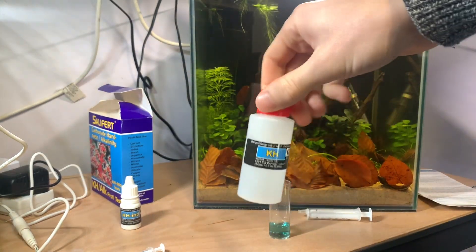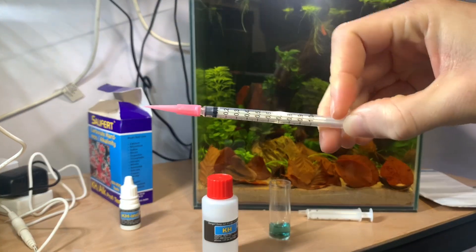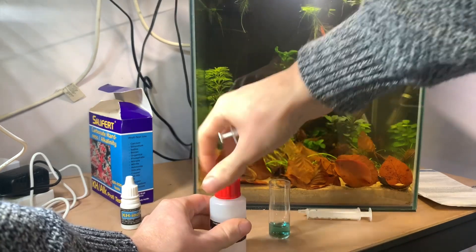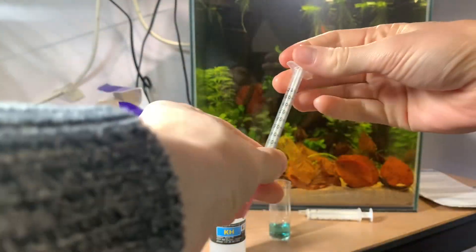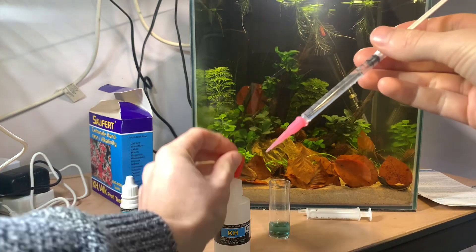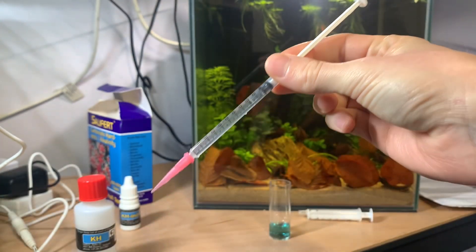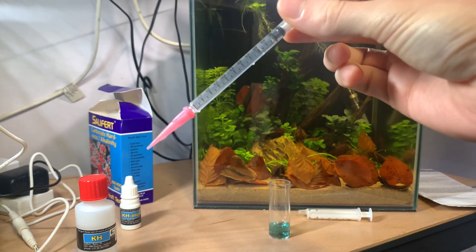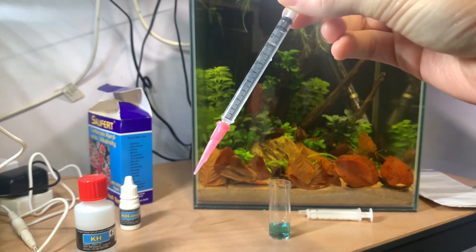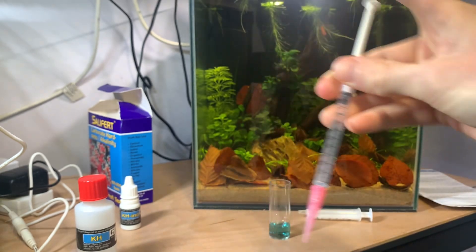Then I have the KH reagent bottle and a 1ml syringe with a pink tip. It comes with the pink tip not attached — just add it on. Draw up to the 1ml line. Don't worry about an air pocket; there is one in this syringe, and that is normal because of the tip. As long as your plunger is lined up with the 1ml mark you will get an accurate result, because you're recording the volume of liquid you are dispensing into your test.